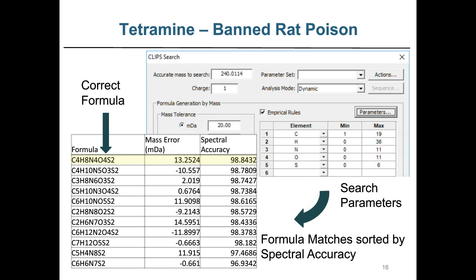And what we do is we simply click on it, and for those of you familiar with accurate mass instruments, we'll do a formula search, okay? So you know some chemistry, you have some pretty good idea of what the elemental composition is. You can, of course, expand this if you're less certain about the elemental composition of your sample. All this does is make the formula list get longer and longer.